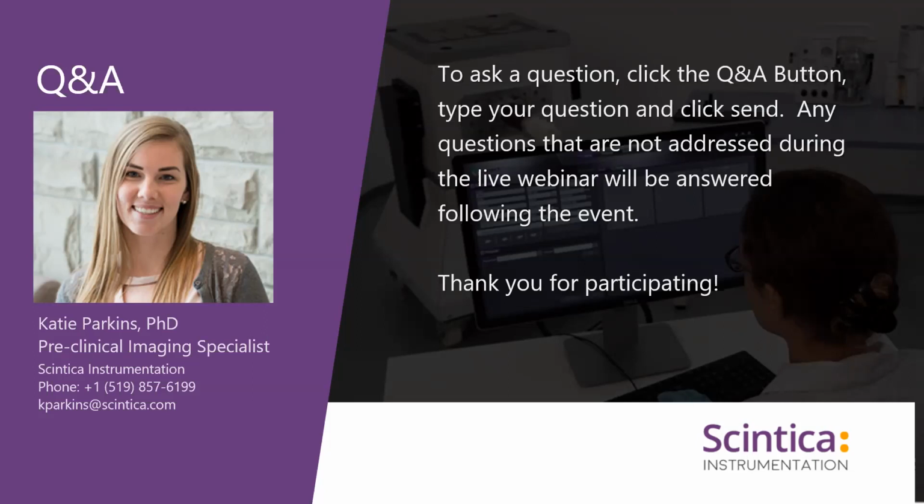Yeah, so what I have done in the past, I went to Dalhousie University, where there's a neuroscientist who is working with this kind of system. What we did was we did not remove the skull completely, rather we shaved the skull down to a very thin bone. So the skull is not completely exposed or taken out, but there is still a fine bone between the skull and the probe. And then we imaged the brain, and the images were captured fine.